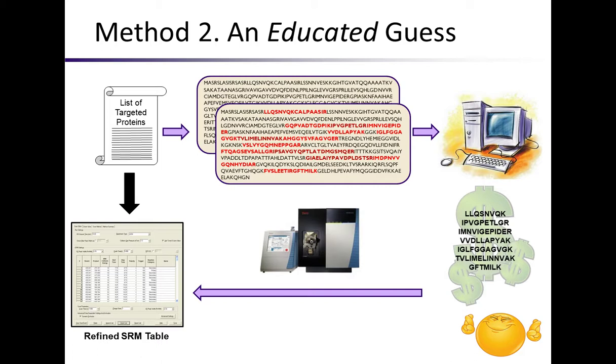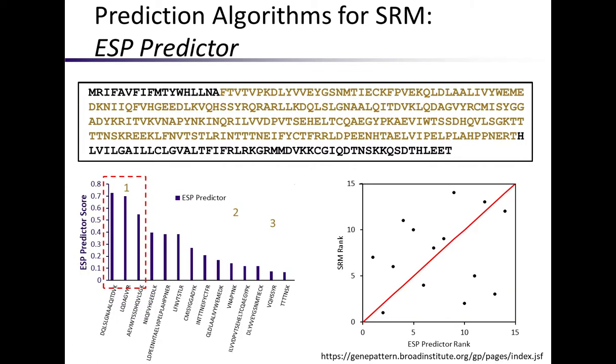We're just going to use the computer, hope that we narrowed this list down well enough for things like peptide length, right? Really short peptides don't fly well, really long peptides don't fly well, so we're going to have an intermediate peptide length, a good hydrophobicity for chromatography. We're not going to have a whole lot of amino acids that can get oxidized, and then we'll do the same thing. We'll buy those ones and run them.